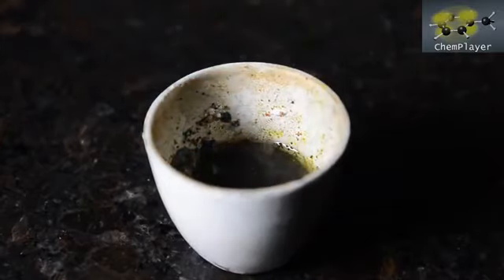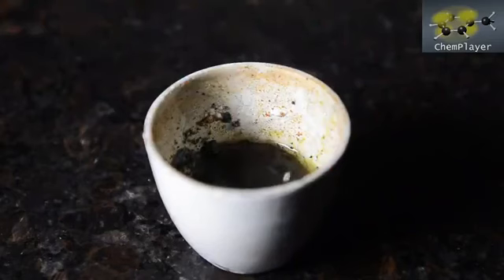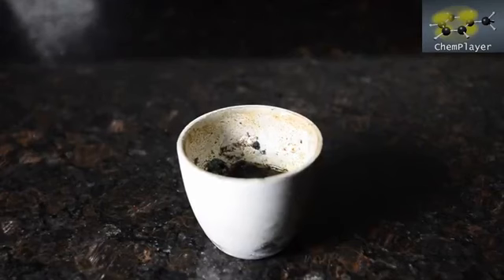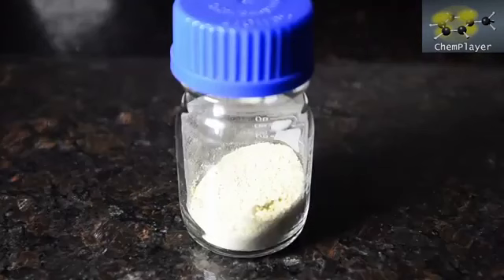So the answer is no. Ferrocyanide isn't going to cut it. There's probably some cyanide in there, but it's not going to be easy to get a pure product out. So let's recap the original process.